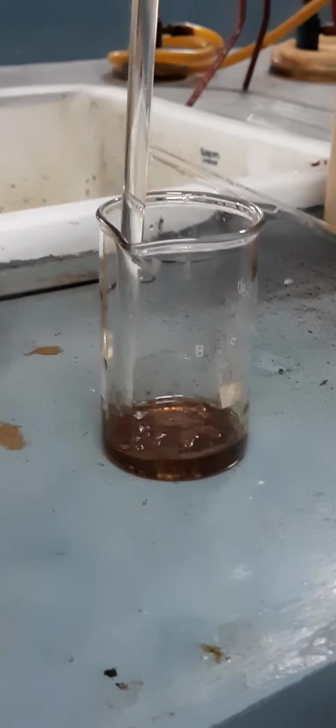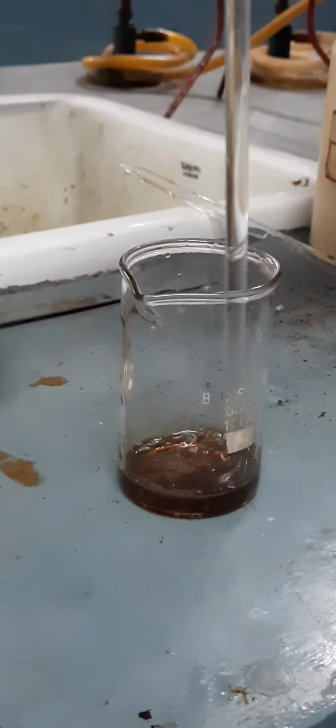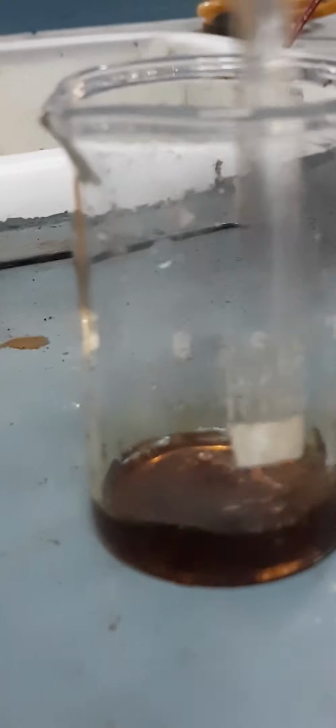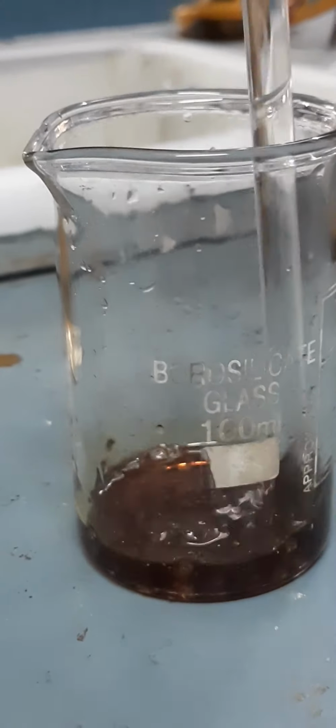This black color formation that you can see over here is basically due to the formation of carbon. You can see that the color is changing.